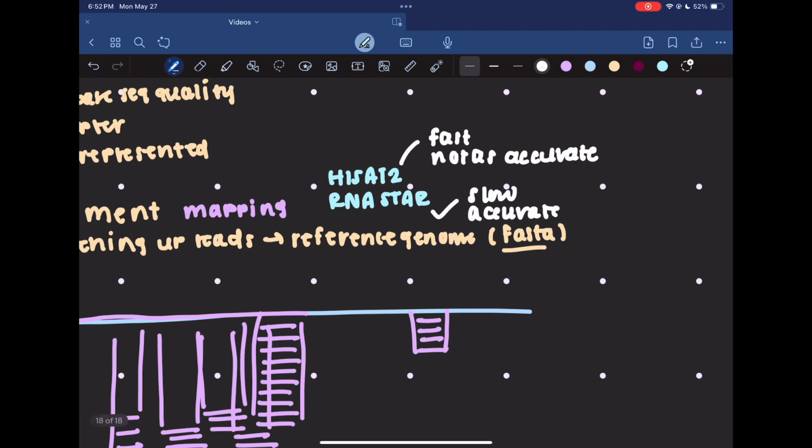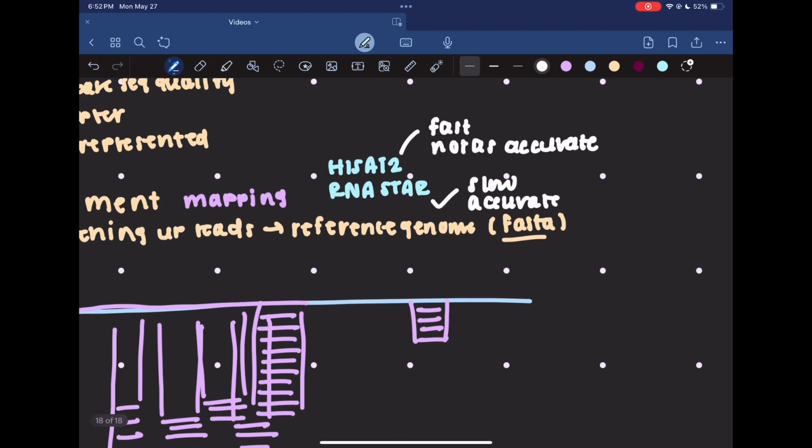It's just not as good at sussing out the position of maybe hard to place reads, whereas RNAstar is good if you have maybe lower quality reads, or you have maybe more of those computational resources, a smaller genome to work with. All of those things are going to make it a little bit easier to use RNAstar.